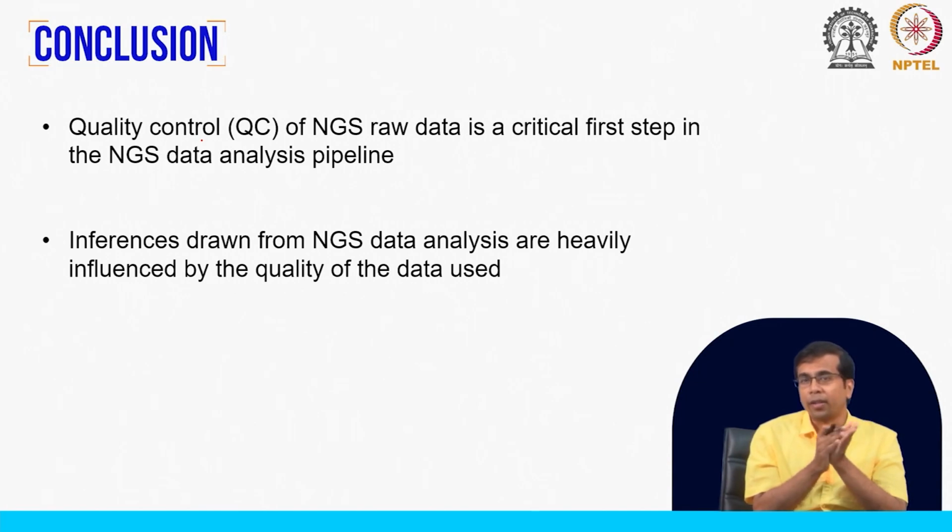We also talked about the tile read quality, where you see if there are any specific problems with the data in certain tiles. This might tell us something about the flow cell itself. There might be some sort of issue, some sort of air bubble, or maybe some sort of dirt particle that is interfering with the signal detection.